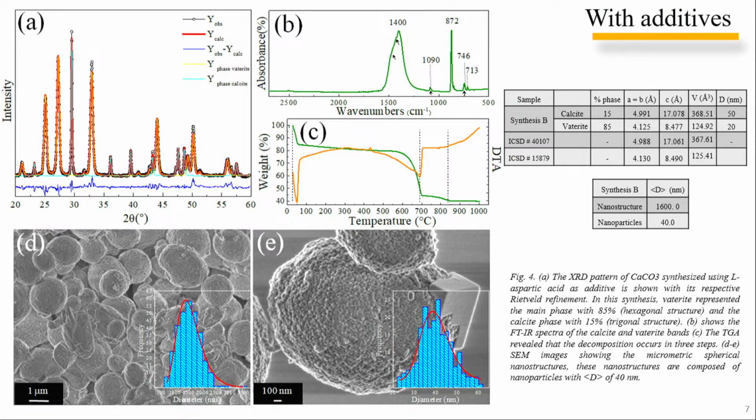Now, the sample with additive. The XRD pattern of the synthesis using aspartic acid is shown with its respective refinement.